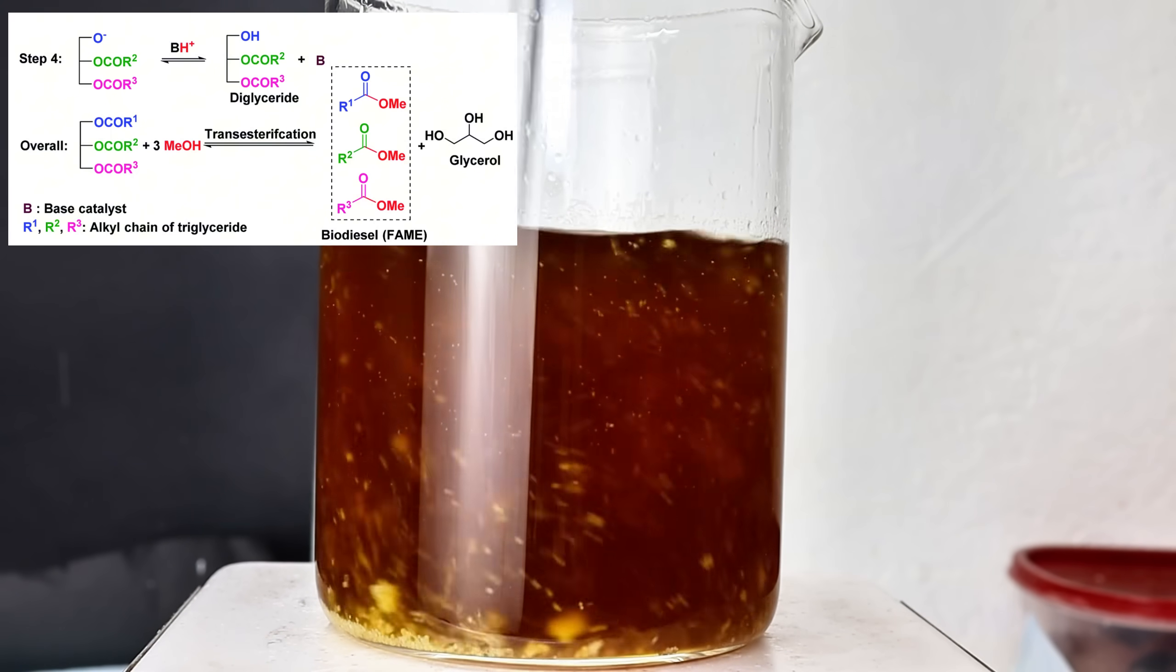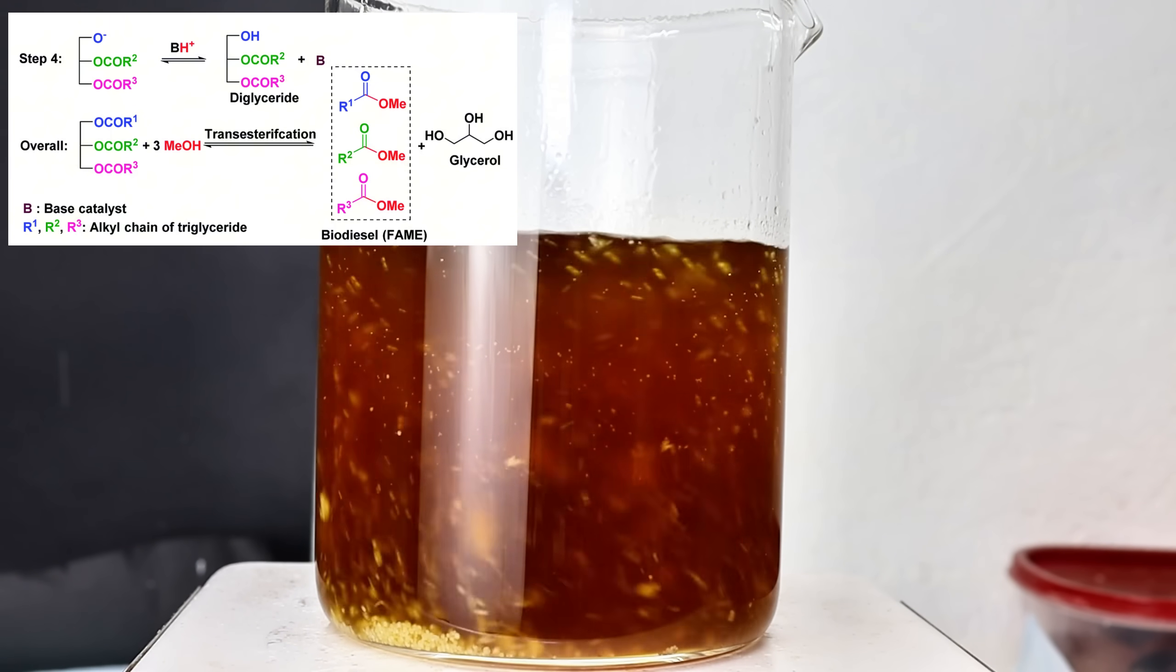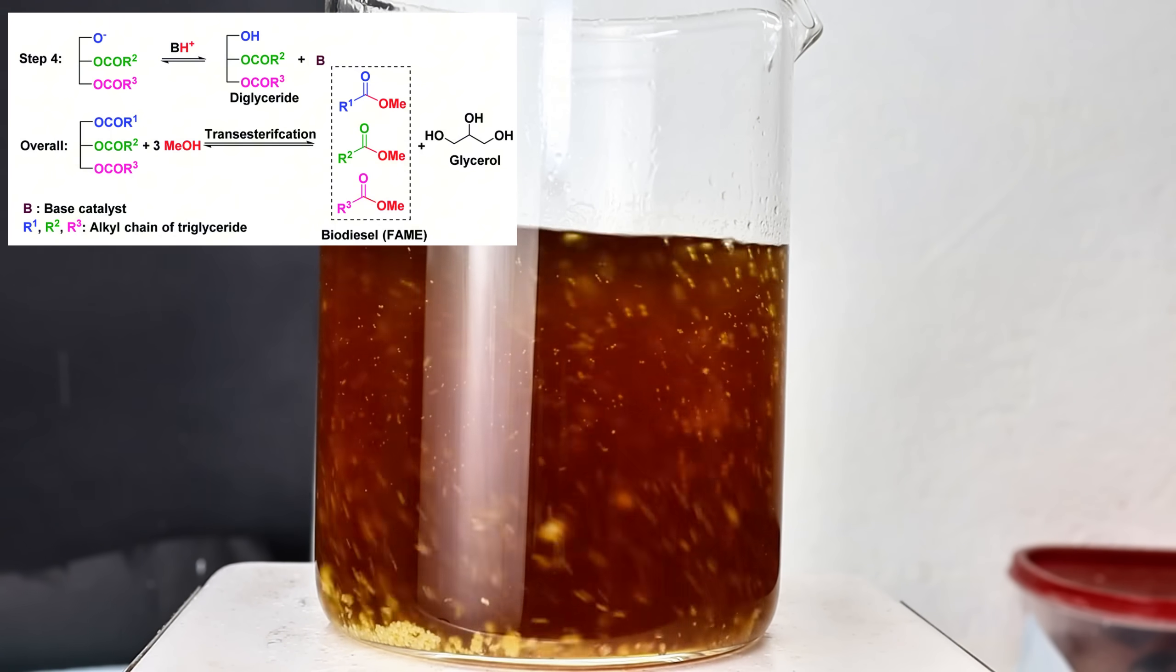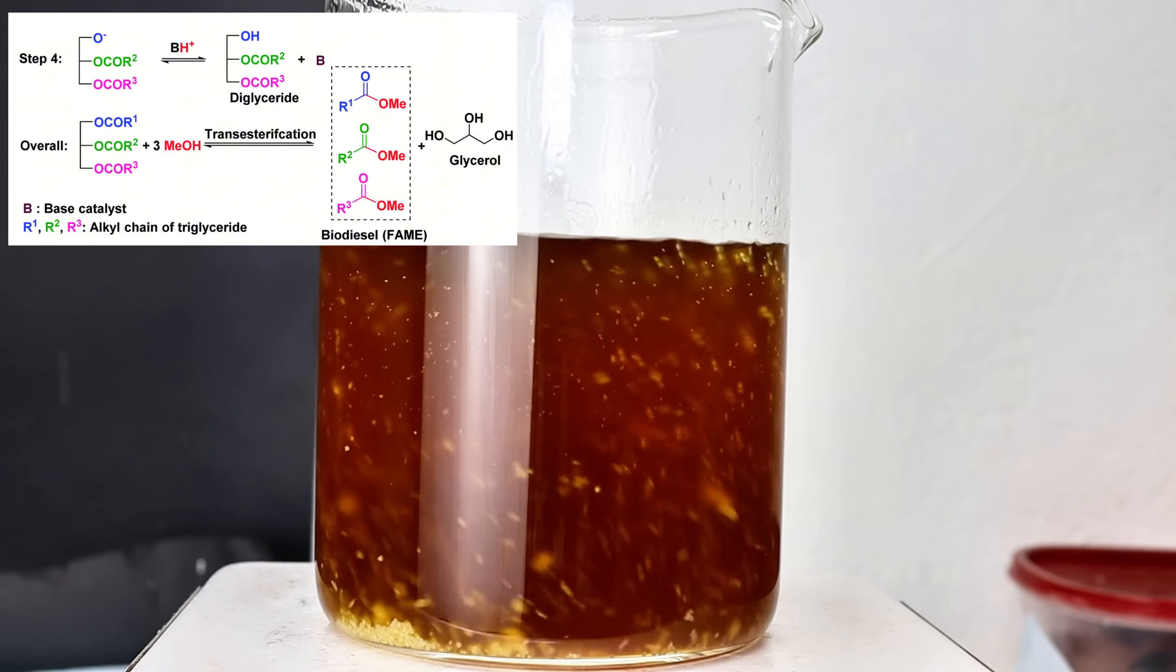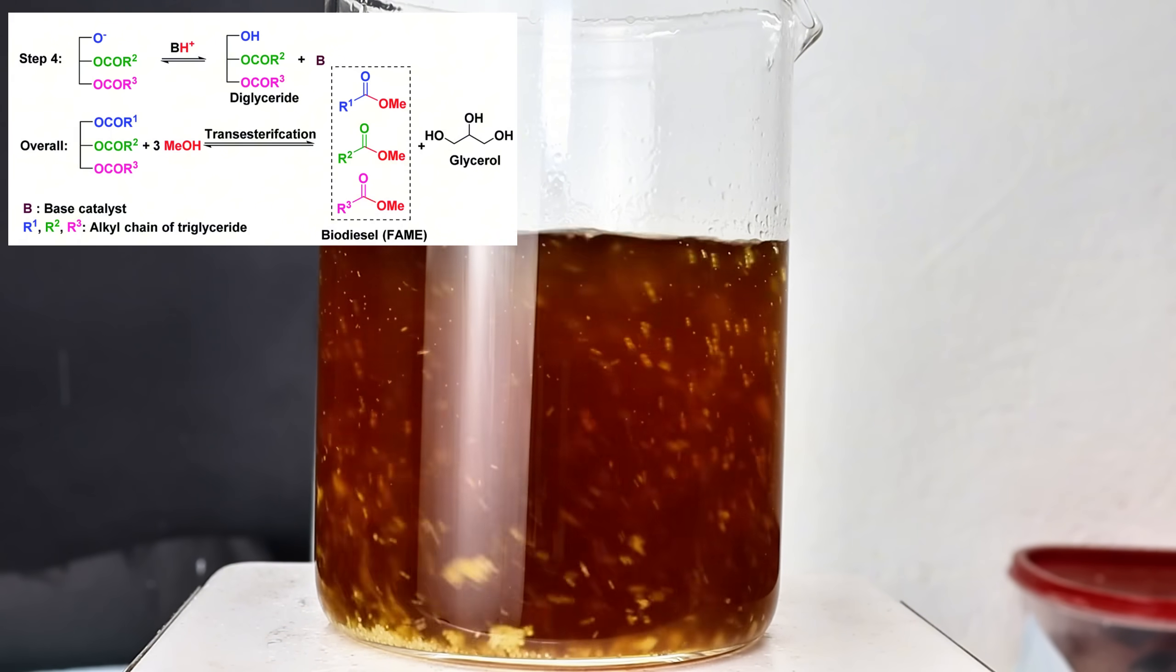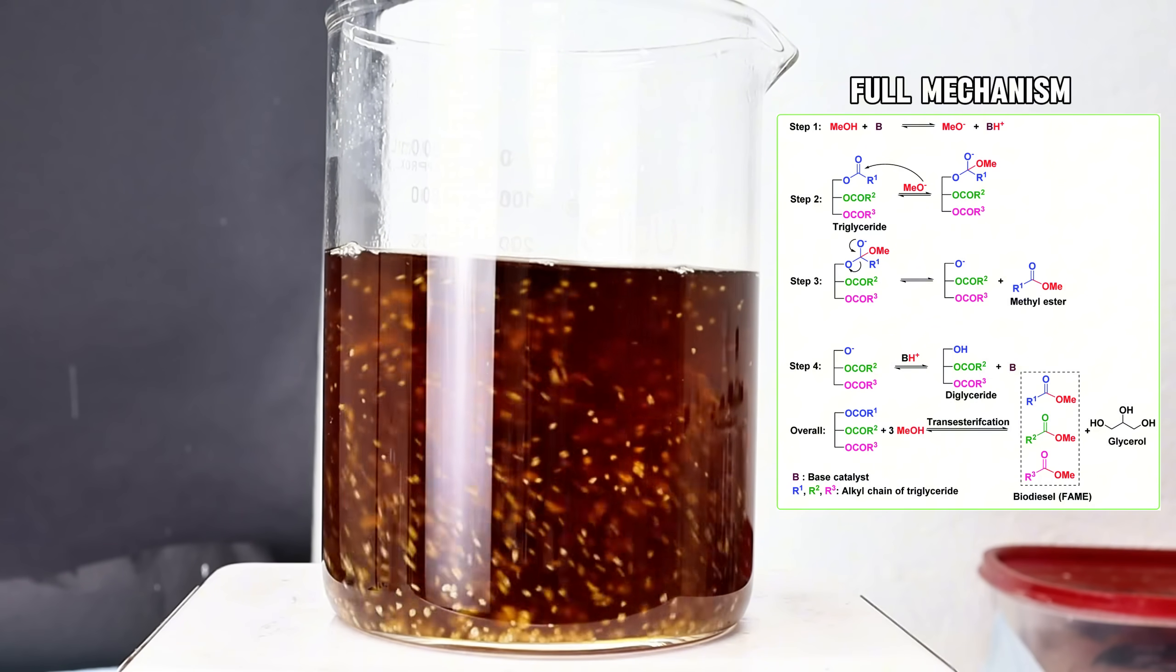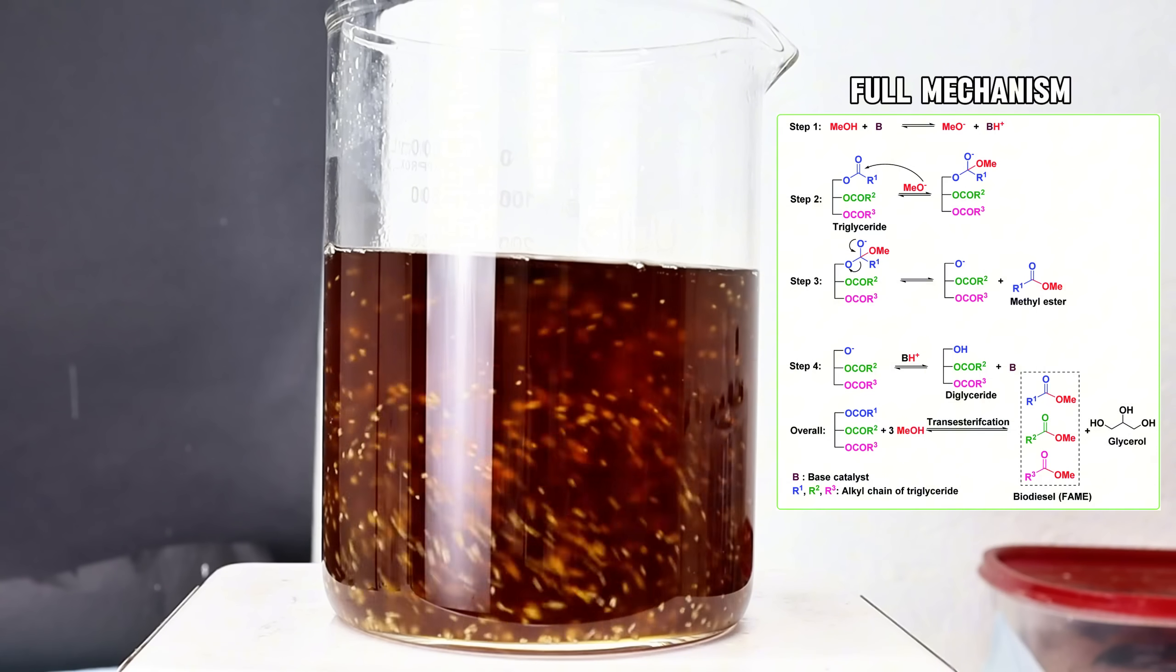This continues until all three fatty acids have been converted to their methyl esters, and the glycerol backbone is liberated as free glycerin. Since hydroxide is regenerated in the final step of the reaction, the sodium hydroxide essentially acts as a transesterification catalyst, and this is why the 5 grams were a fairly large excess.